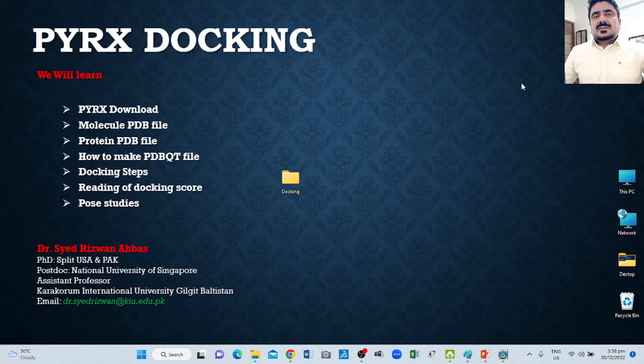So, my dear students and respectable viewers, today we will learn about the PyRx software. PyRx is free software that you can download and install on your computer, and you can learn the basics of ligand protein docking. In this video, we will completely learn about it.